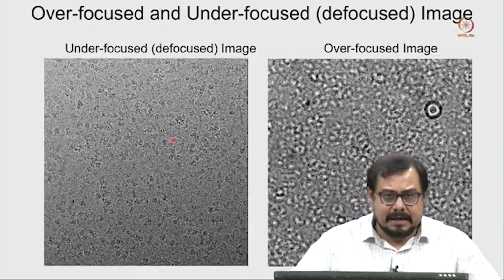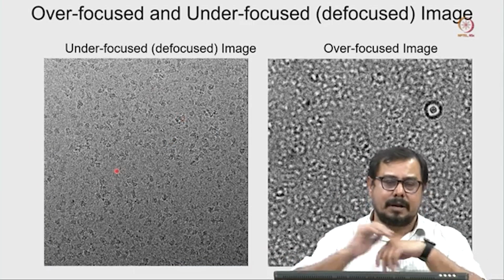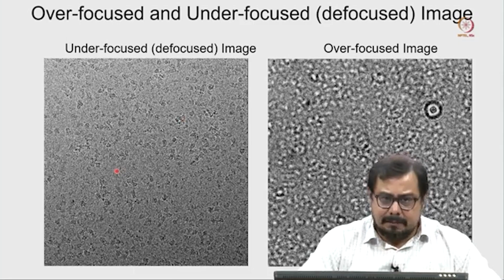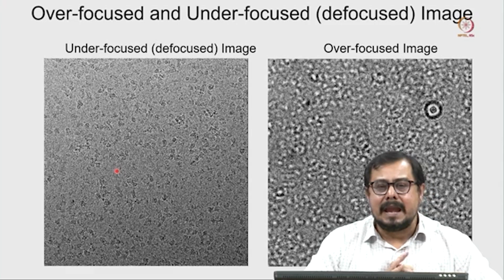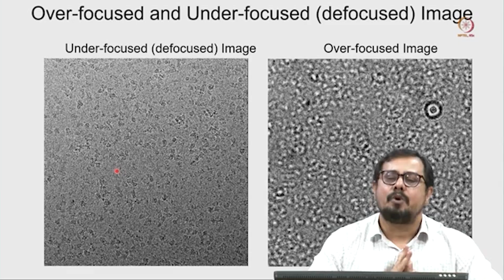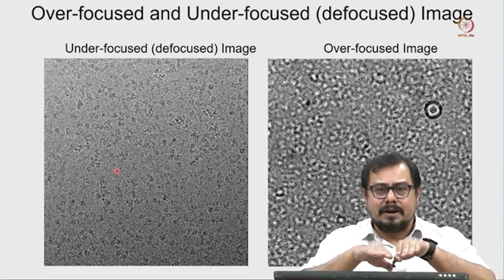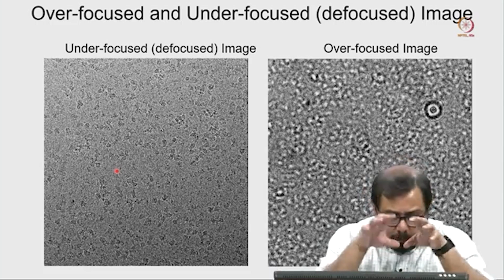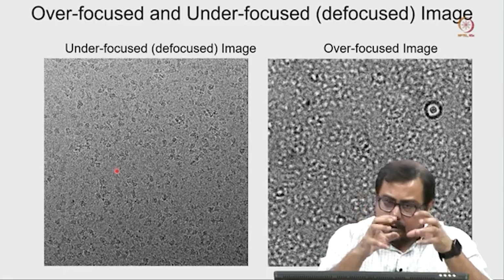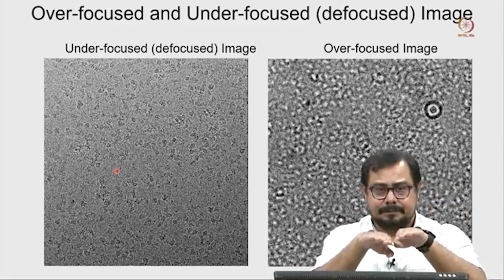So if you come here, this is a cryo image. One more condition you should remember, I discussed a little bit about cryo-electron microscopy: we are not using any staining solution. Your sample will stay in a normal buffer solution, a phosphate buffer or Tris buffer or HEPES buffer, and the contrast between the sample or protein sample, whatever you consider, and your buffer is almost the same.